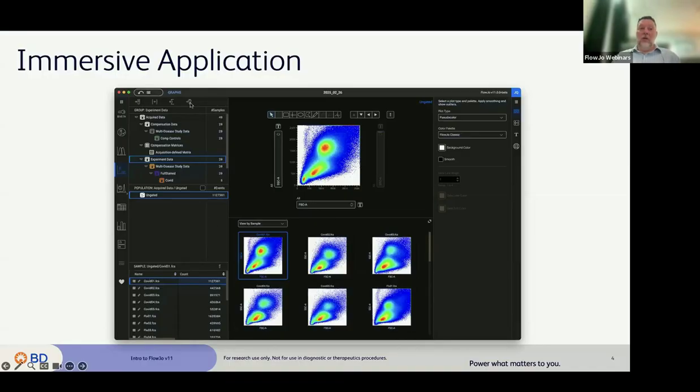Up in the top left-hand corner, we've got some basic actions similar to the FlowJo 10 static toolbar. This is add samples. Personally, I like to drag and drop. It's just out of habit, but you can also navigate through your file system with the little plus button to add samples. This plus next to it is to create groups. You can see the icons are similar to V10, even if they don't have the coloring. Add statistics and add keywords. So statistics and keywords can be added to the table here through these applications.